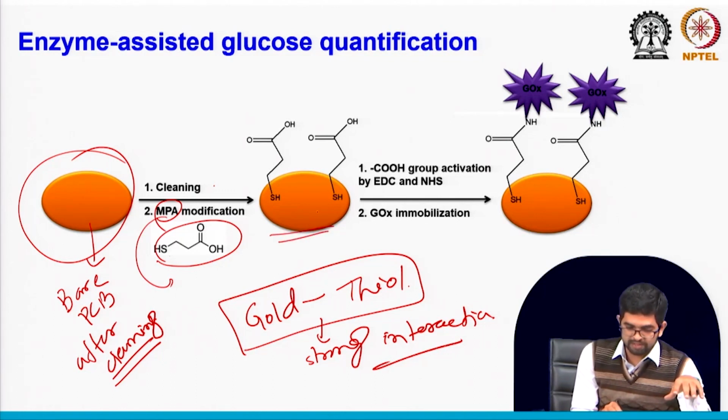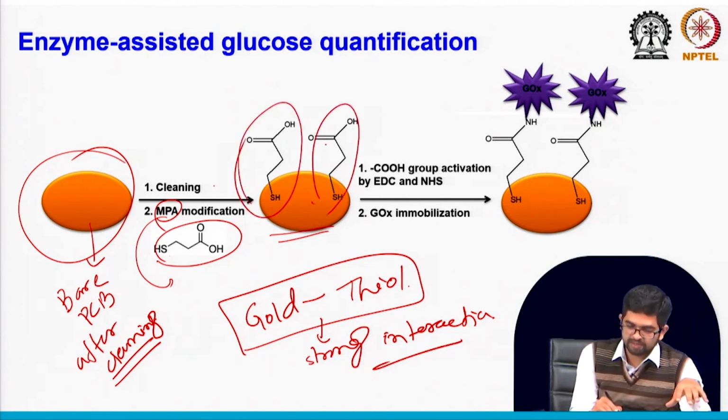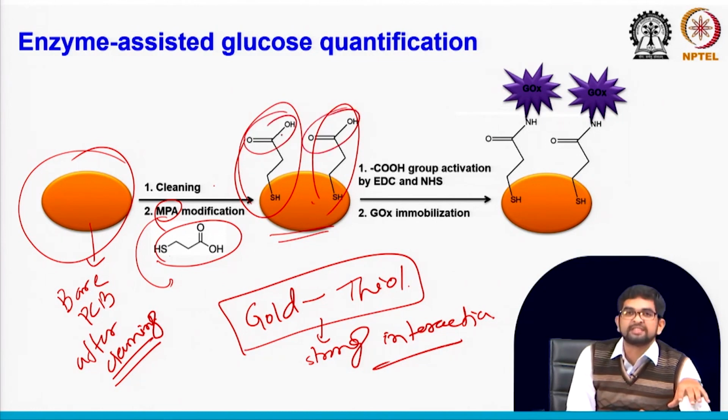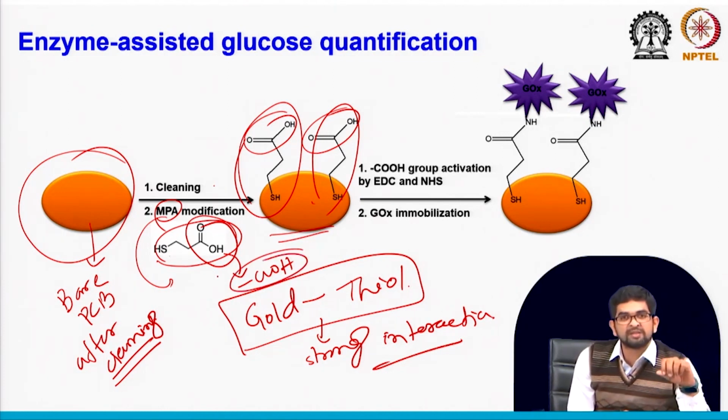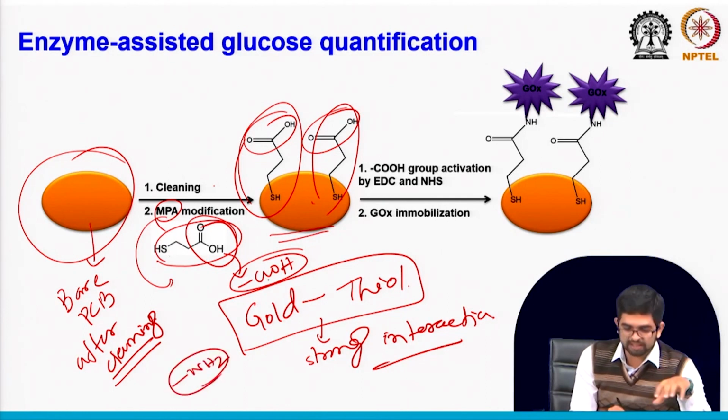So this is your PCB based biosensor. We just drop casted the mercaptopropanoic acid, then we washed the surface, and then we got this carboxylic acid group on the sensor surface. So mercaptopropanoic acid has a functional group, and this functional group is COOH. This is a very important functional group for biosensor development, COOH or maybe an amine group you can functionalize. In this case we tried the carboxylic group and we used MPA.